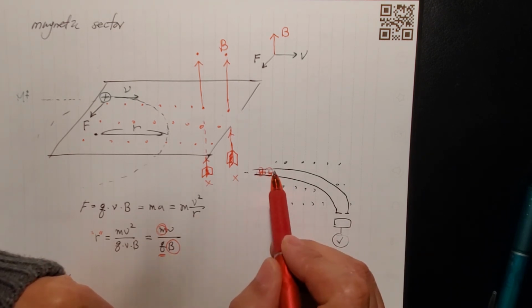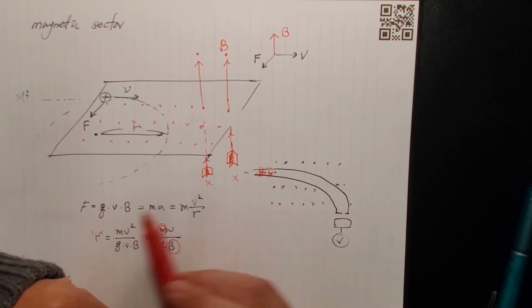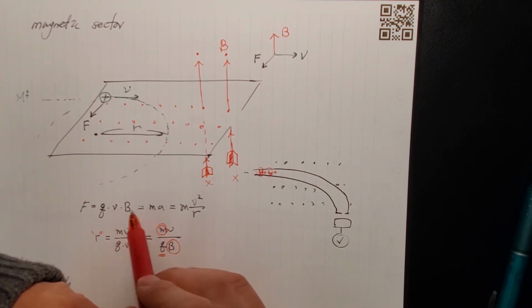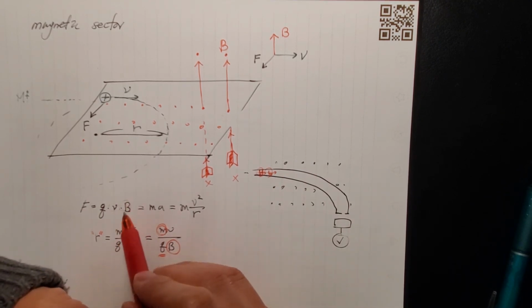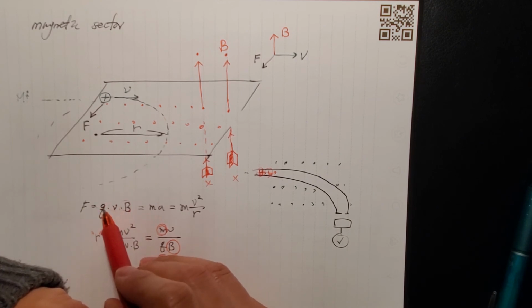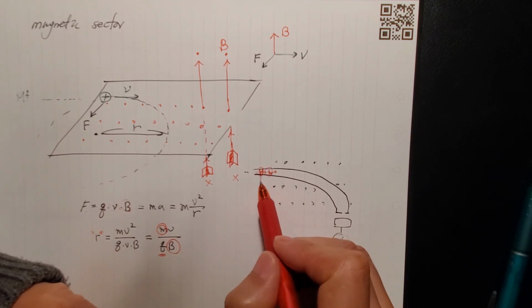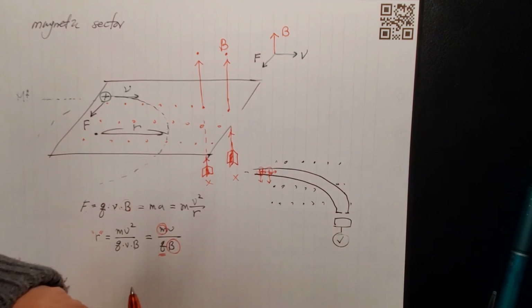Since they are flying, they're getting force because their speed is the same, and at a certain given time the machine is giving a constant magnetic field, and the charges are all +1, so they're all getting the same force pushed this way.